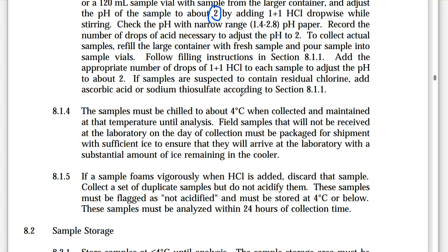So what you're going to find out is that there can be multiple SOPs that come from only one method, and that is perfectly normal. We would have an SOP for our field collector, an SOP for our lab worker, an SOP for our glassware cleaner, and SOPs for a number of different roles that have responsibility in this particular type of method.